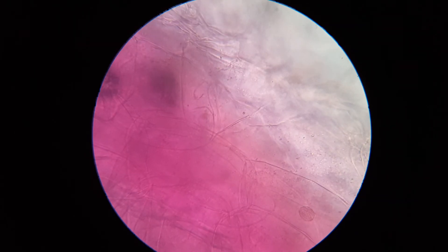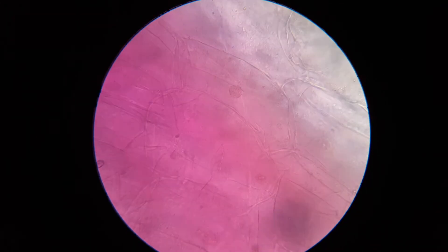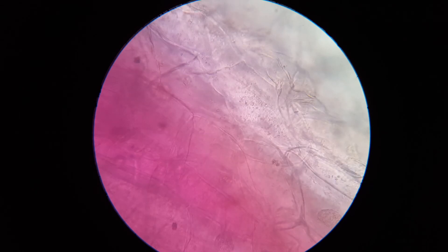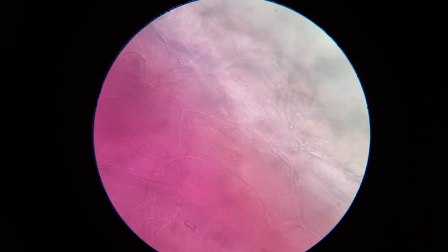Look at that — we are already at the 40x objective and we're already seeing a nucleus. You can see lots of nuclei all over the place. That's the cell nucleus, and you can see the cell wall, of course.